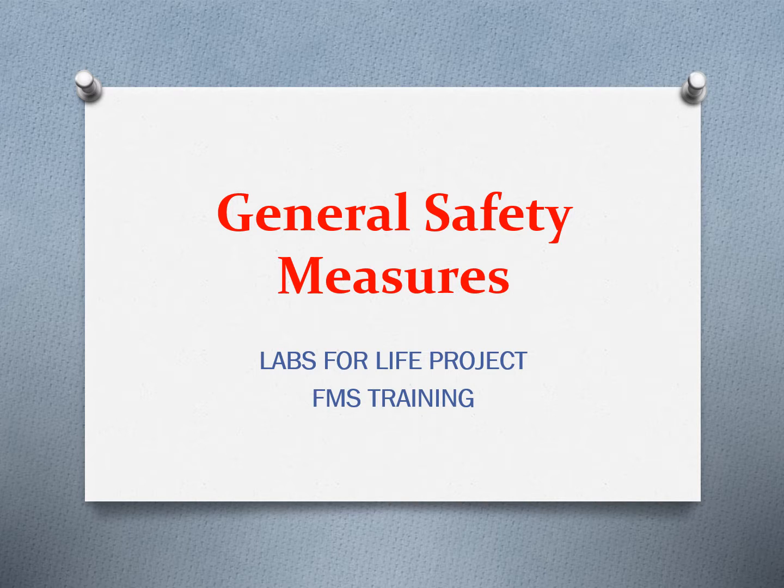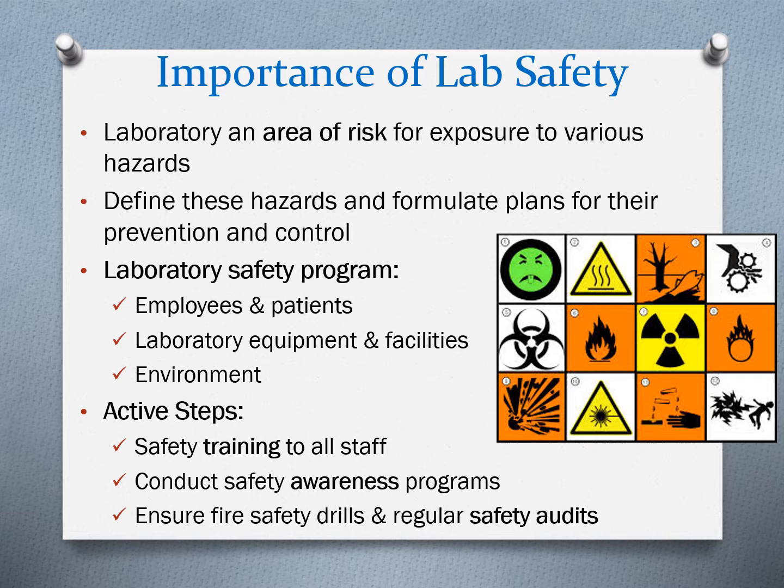General safety measures. They are the processes to be followed to ensure safety while working in a laboratory. The importance of laboratory safety. A laboratory is an area which is filled with the risk of exposure to various hazards. It is important to define all the hazards in a laboratory and formulate plans for their prevention and control.